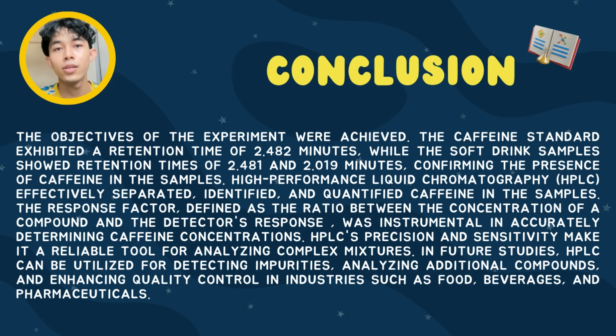In future studies, HPLC can be utilized for detecting impurities, analyzing additional compounds, and enhancing quality control in industries such as food, beverages, and pharmaceuticals.